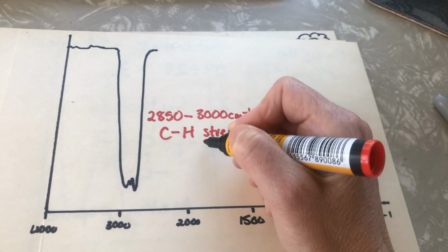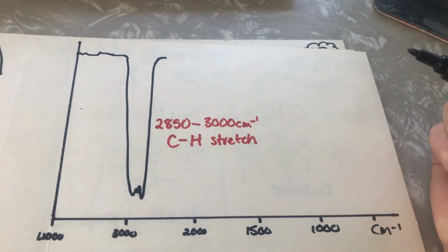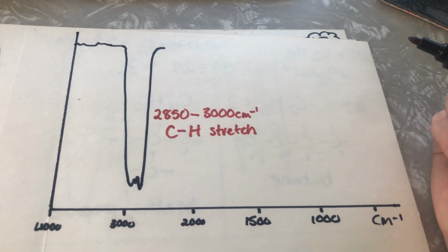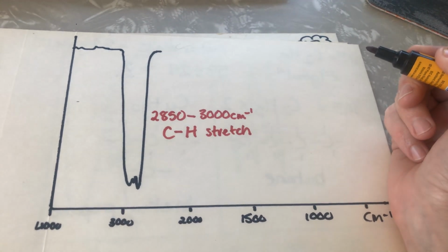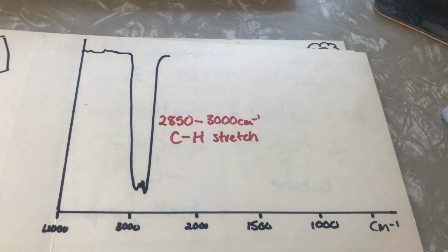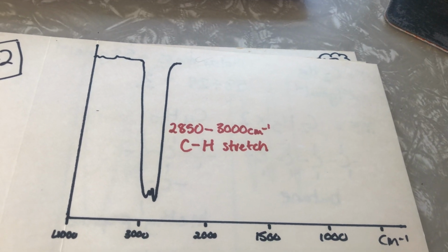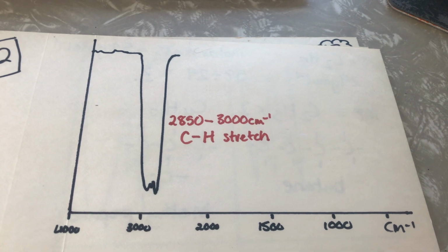Now, the stretching is the way that this bond moves in order to absorb the infrared radiation. So this one is a peak that is always here. You always find this. So it's actually not one that I want us to concentrate on discussing, because all organic compounds contain CH and therefore this peak.